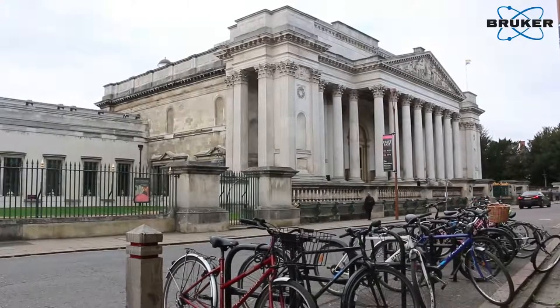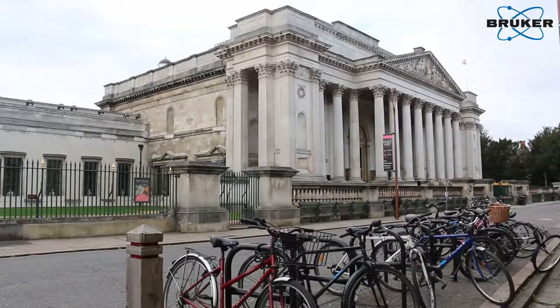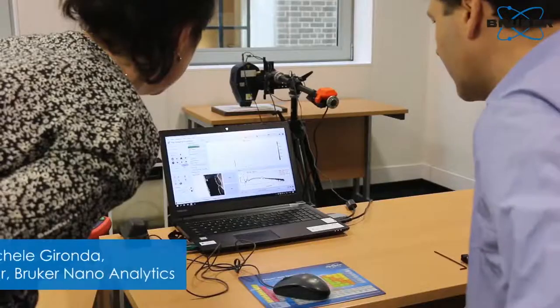The Fitzwilliam Museum has a small number of miniatures painted by Isaac Oliver, so that's how we started working on him. The results we were getting from the initial analysis were so interesting that we liaised with collections across the UK and also elsewhere in Europe, and these collections have granted us the possibility to work on their miniatures as well.